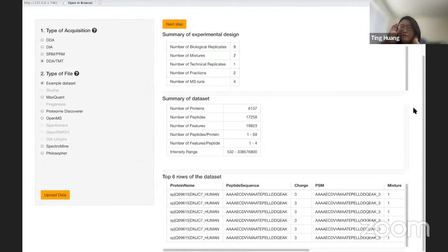I think we have an error in Q&A. I think we saw this error before, but it should be already fixed. Vijaya, please make sure you download the latest version of MSstatsShiny, because we used to have this error, but we think we have already fixed it in the most recent version of MSstatsShiny.